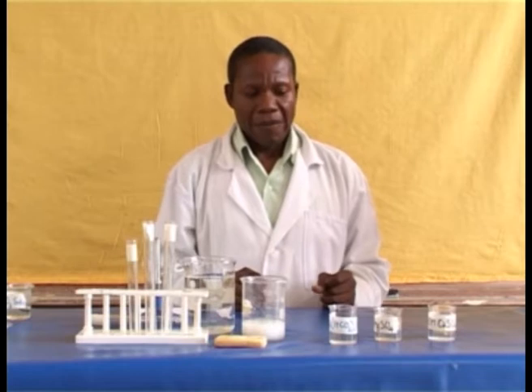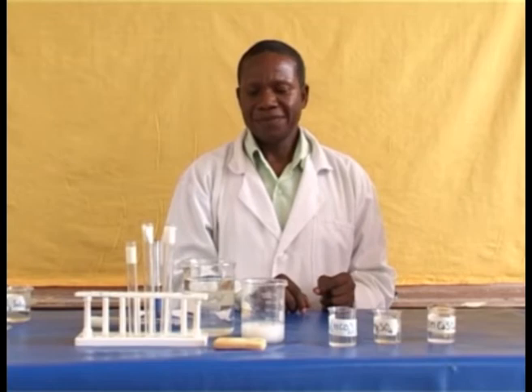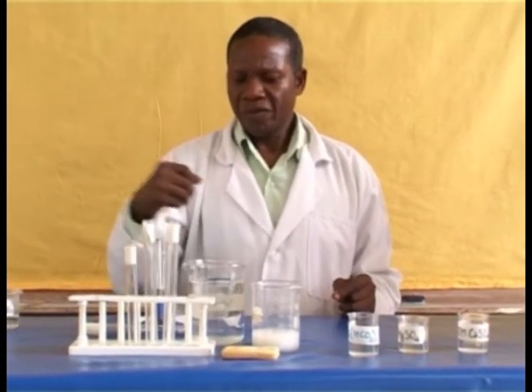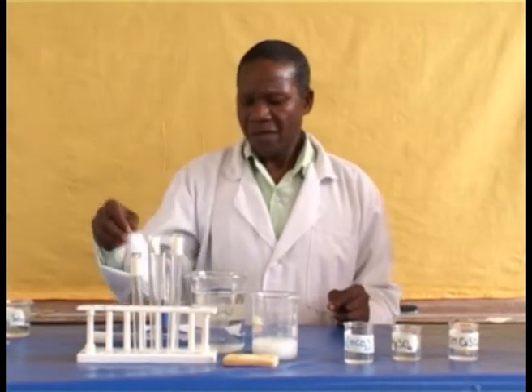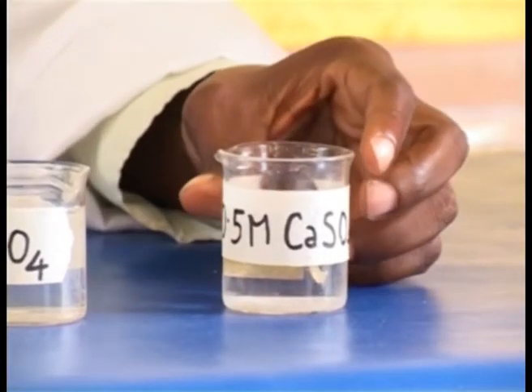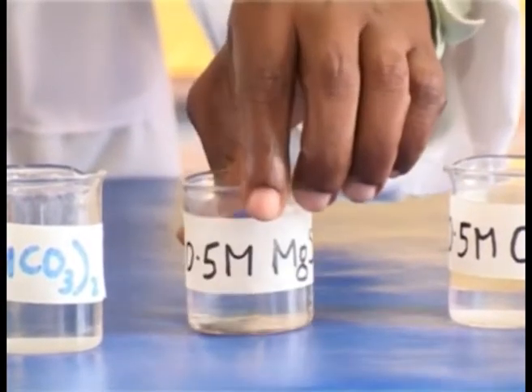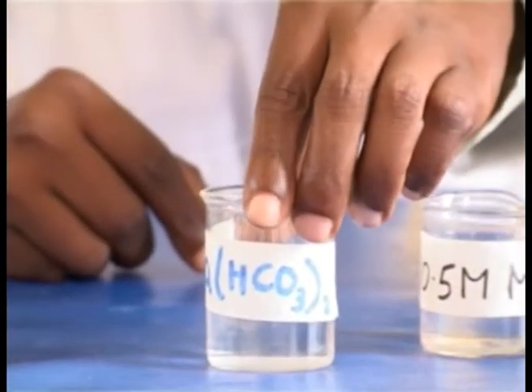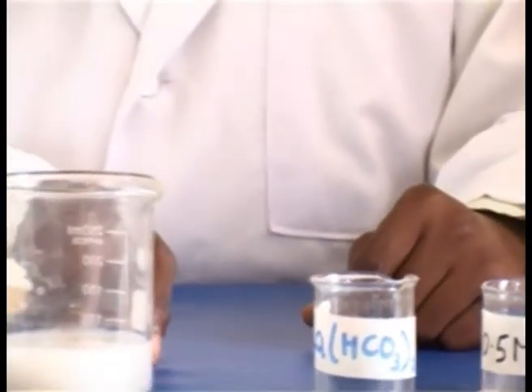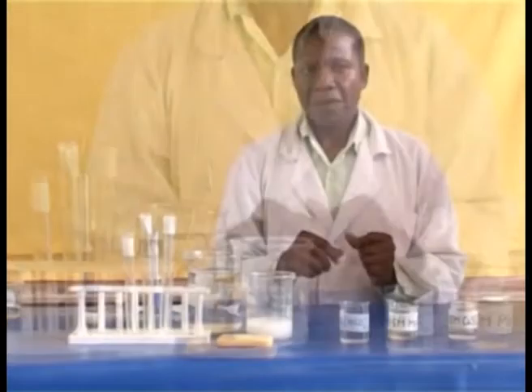Requirements. Apparatus: 5 beakers, 3 test tubes, test tube rack, source of heat. Chemicals: 0.5 molar calcium sulfate, 0.5 molar magnesium sulfate, 0.5 molar calcium hydrogen carbonate, soap solution and distilled water. Procedure.